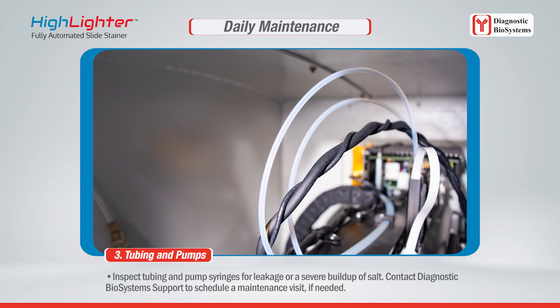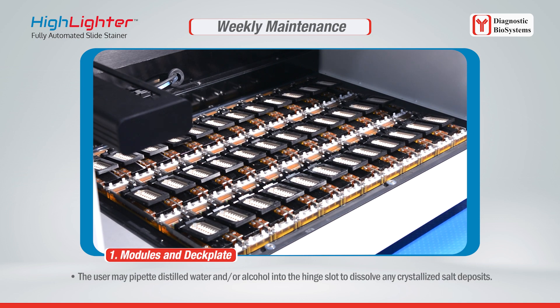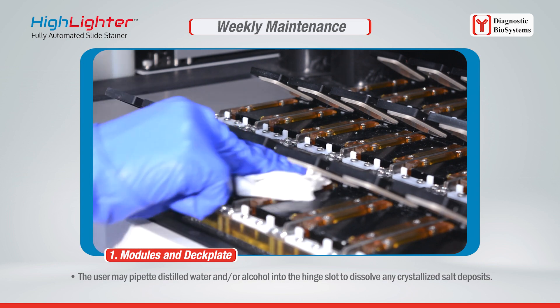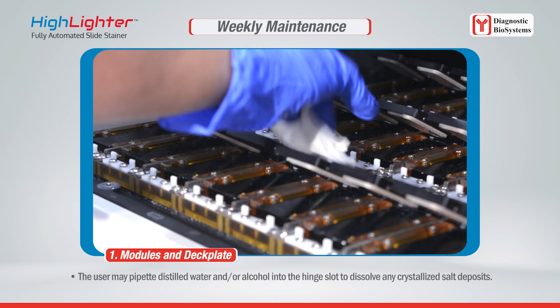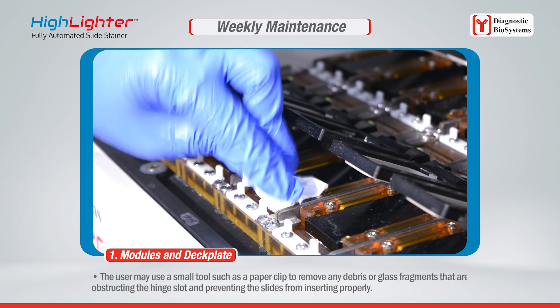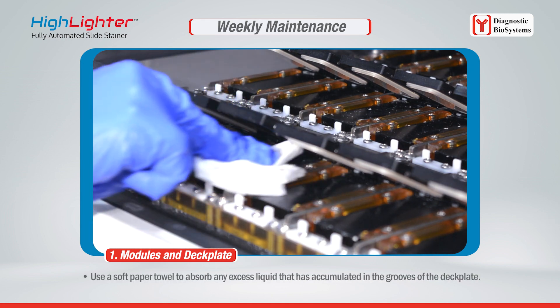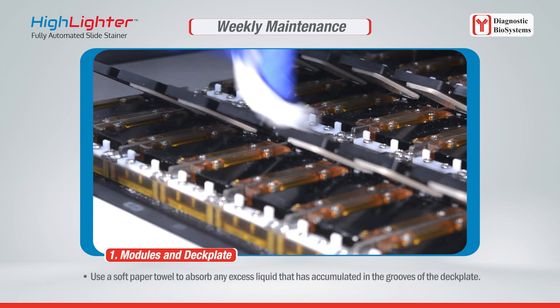Contact Diagnostic Biosystems support to schedule a maintenance visit if needed. For weekly maintenance, the modules and deck plate should be cleaned and inspected routinely to maintain proper function. Use a damp paper towel to wipe away any salt deposits that have accumulated on the module surfaces. The user may pipette distilled water and/or alcohol into the hinge slot to dissolve any crystallized salt deposits, or use a small tool such as a paper clip to remove debris or glass fragments obstructing the hinge slot. Use a soft paper towel to absorb any excess liquid in the grooves of the deck plate.